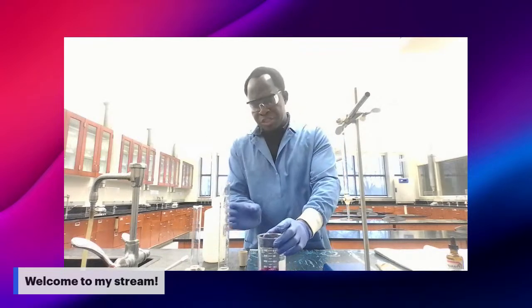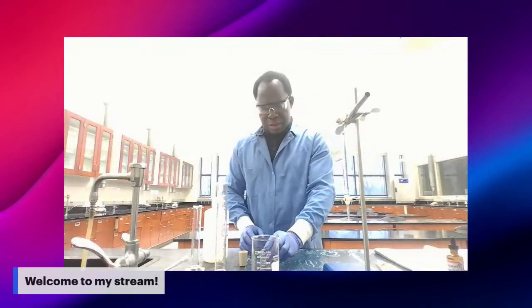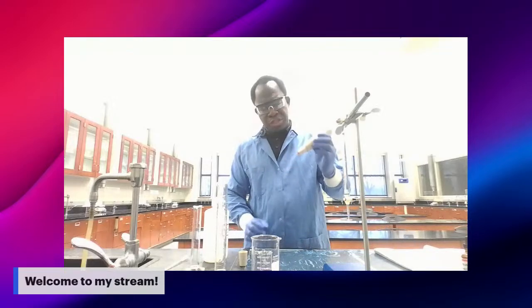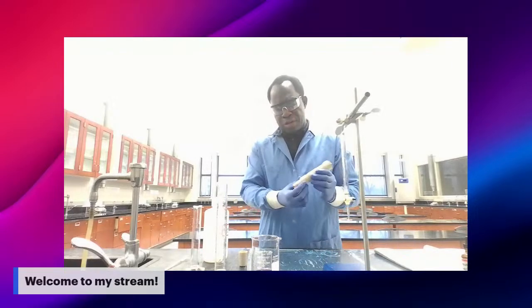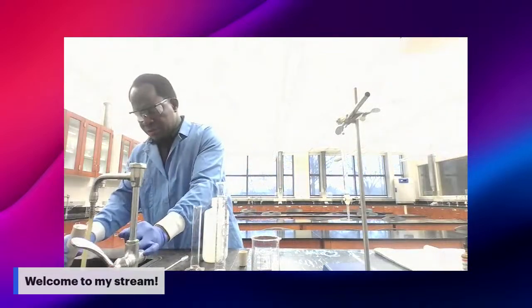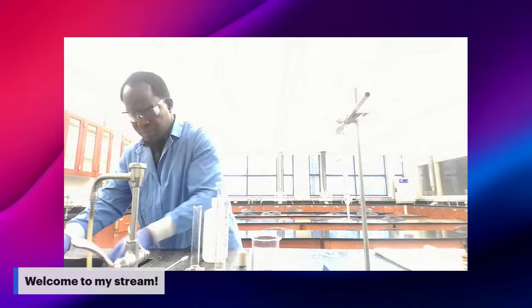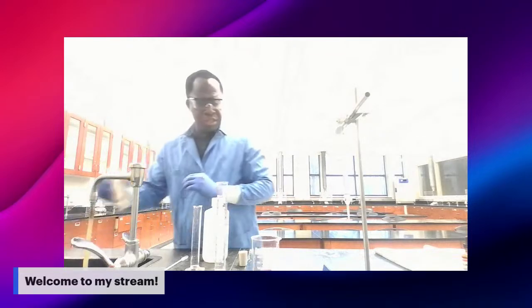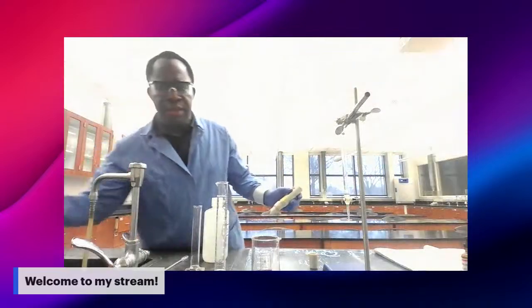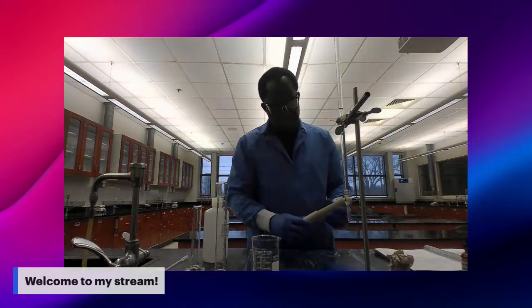Make sure you wash everything, wash your beaker, and make sure you wash the probe of your pH meter. You wash it, and then you dry it. And you put it back.